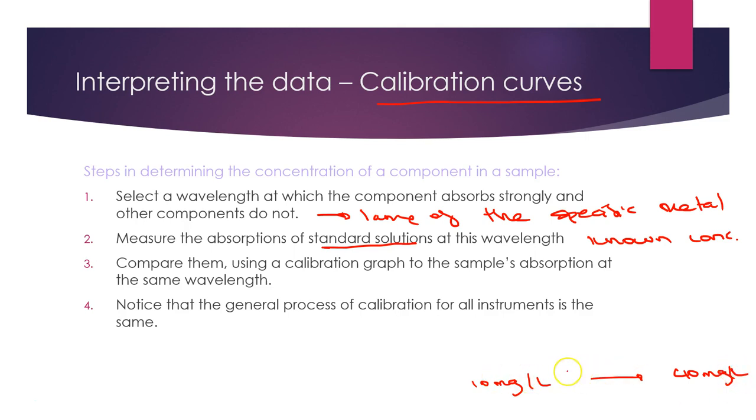And then we would have different concentrations along the way, so 15, 20, 25, 30, 35. We would then take readings for each one of these samples in our machine, and we would get a reading for it. Okay, so that then means that we can plot a graph of these, run our unknown sample, and then interpret where it ends up on the graph.